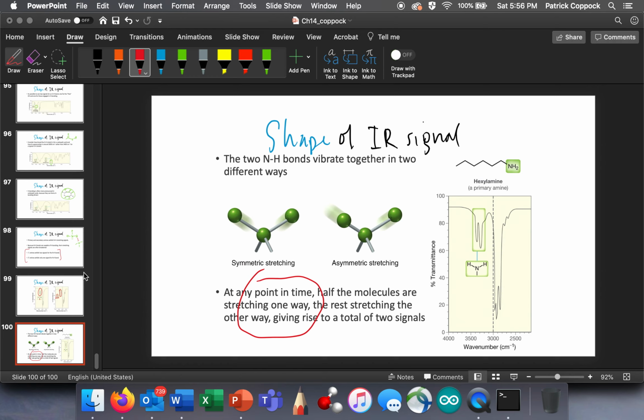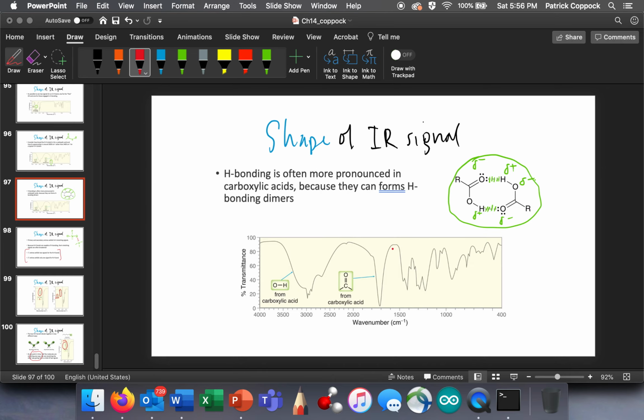All right, so in review, the shape of the signal is important. This is sort of a weird shape, like a double tooth. But mostly the shape we focused on was the broadening, and we also focused on bringing the peak upfield. It's really sort of the wave number issue. Bringing this upfield was because of hydrogen bonding.